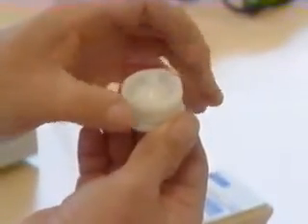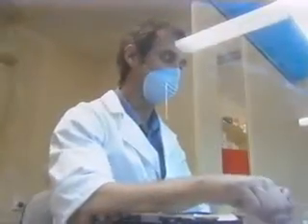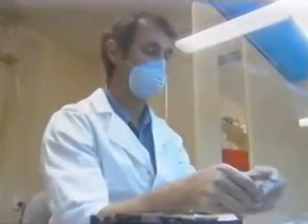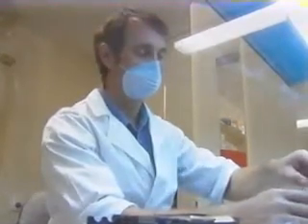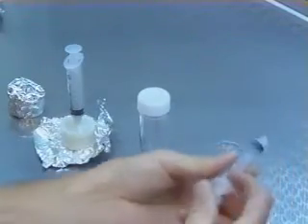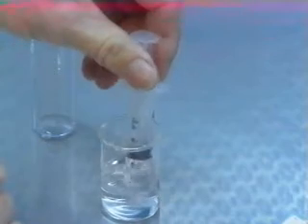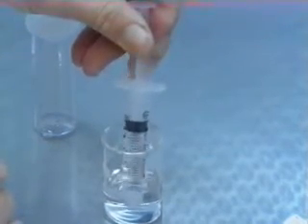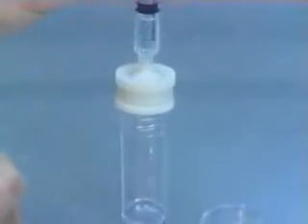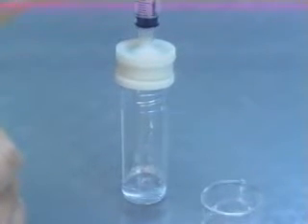All the instruments and equipment needing to be used must be either autoclaved or soaked in 95% alcohol. For example, the hypodermic syringe and the container into which the compound in question is going to be filtered. The compound in question is drawn into a hypodermic syringe and then passed through the filter like this in a laminar flow cabinet or any other clean environment.